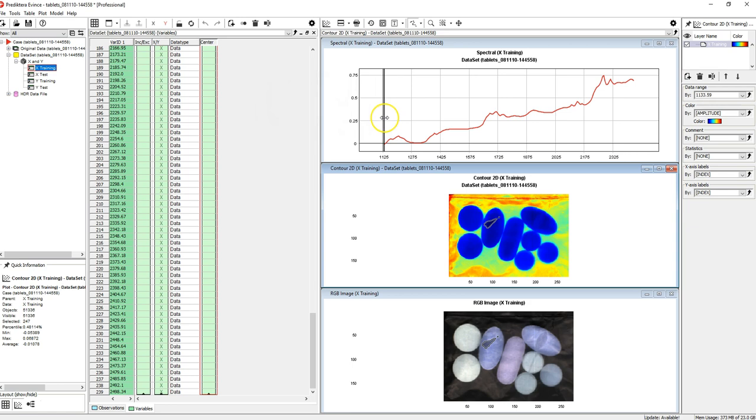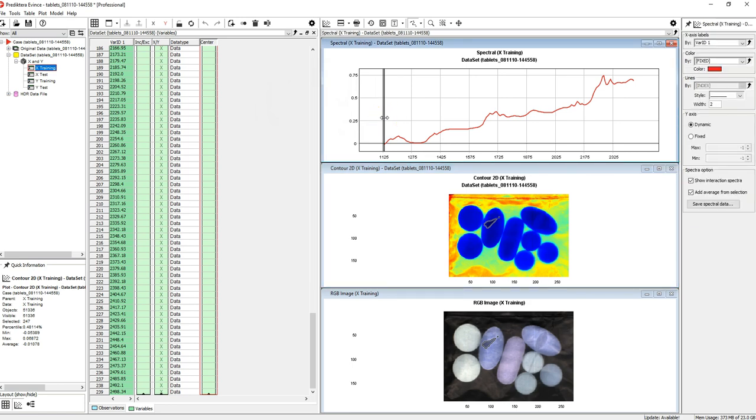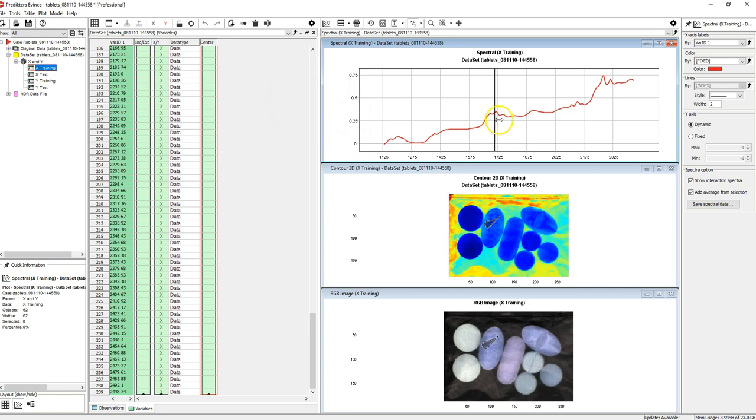By dragging this vertical line in the spectral plot you can change the wavelength that is being used for the coloring.